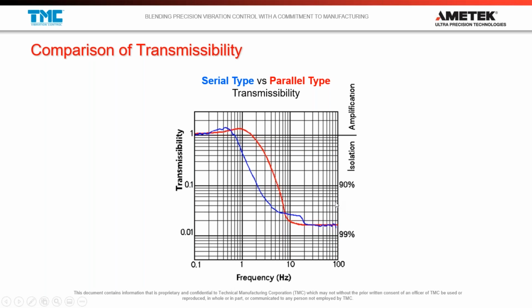Incidentally, we've never seen a problem from this resonance at such low frequencies. At a sub 1 hertz frequency, we're really talking about rigid body motion, and such a small amount. I've seen very, very few applications where such a low frequency resonance has actually become an issue. But what we're trying to achieve here with piezoelectric systems is as low a resonance as possible and as good an isolation factor beyond that resonance, which we're achieving, as you can see in these curves.